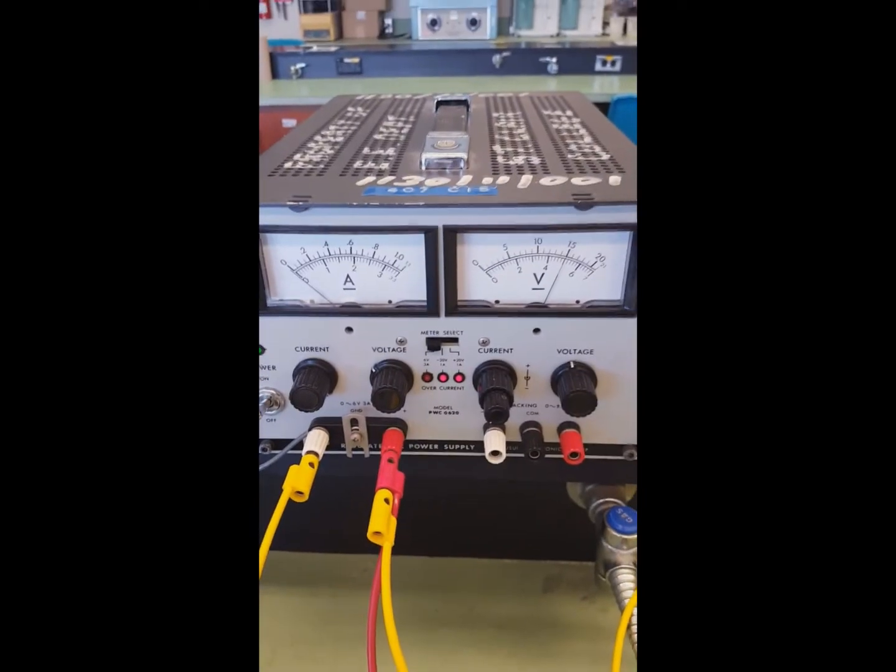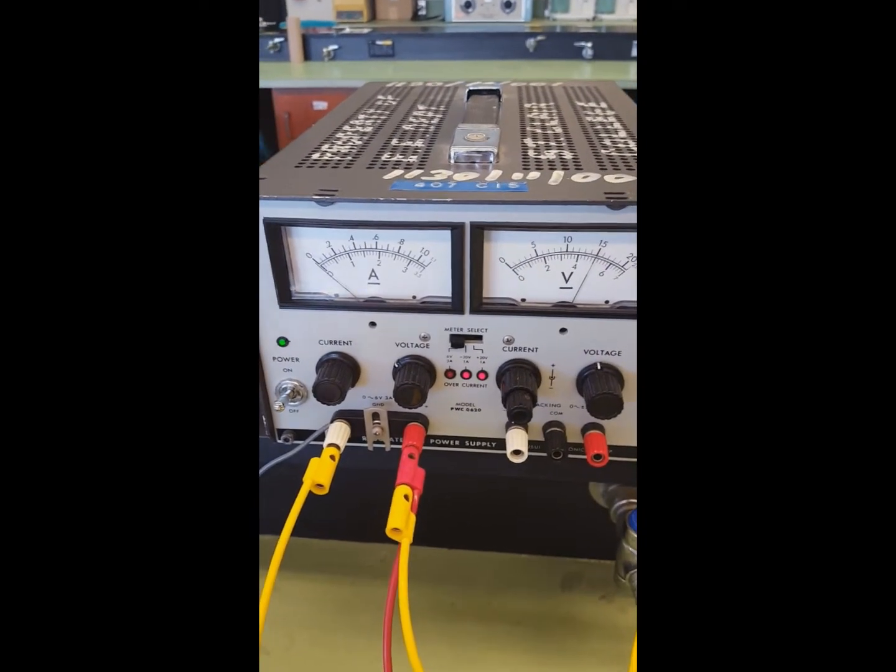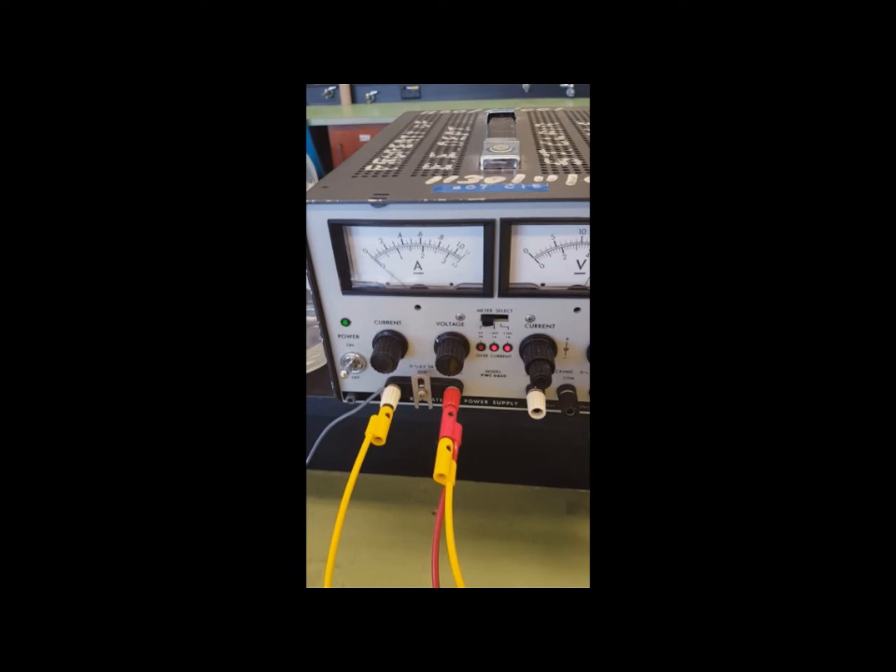Now, I want to point out to you here that we are operating this under what's called constant voltage control. So before you turn the power supply on, turn the current dial fully clockwise. In other words, you're going to allow full current to flow. Now, that doesn't mean you'll get full current. It means that the current will not be restricted. The amount of current you get is determined by the voltage you apply and the surface area of the electrodes. In this case, the surface area of the wire is the rate limiting step. The more surface area you have on the wire, the more current you're going to have flowing.